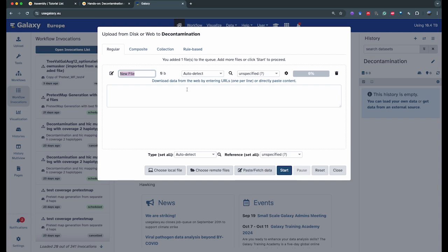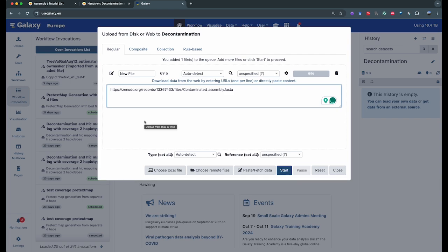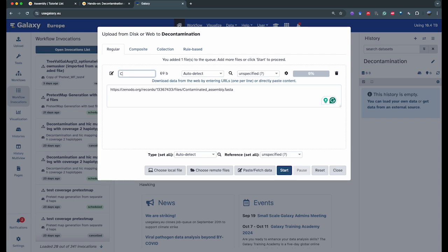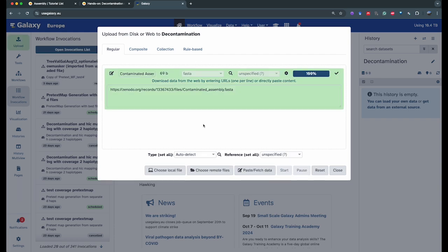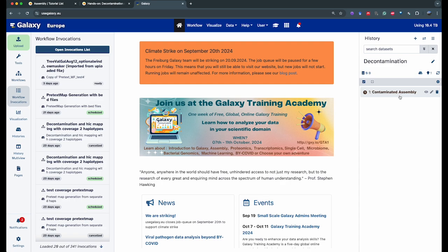Click on paste fetch data and you see this window where you're going to paste the URL for the assembly FASTA. We're going to call it 'contaminated assembly' and we're going to tell Galaxy that it's a FASTA file, then click start to begin the upload. It's going to go green in the small window indicating it understood the URL. We can close the window — it starts gray meaning it's waiting, then switches to yellow meaning it's downloading the data into your history. We're going to wait until it gets to green.